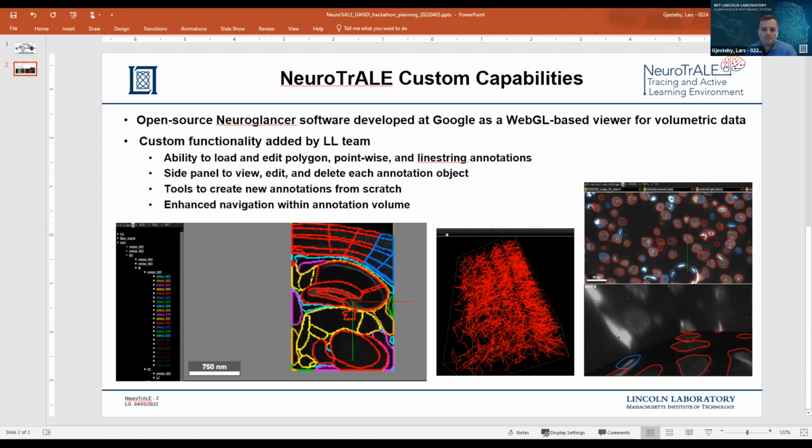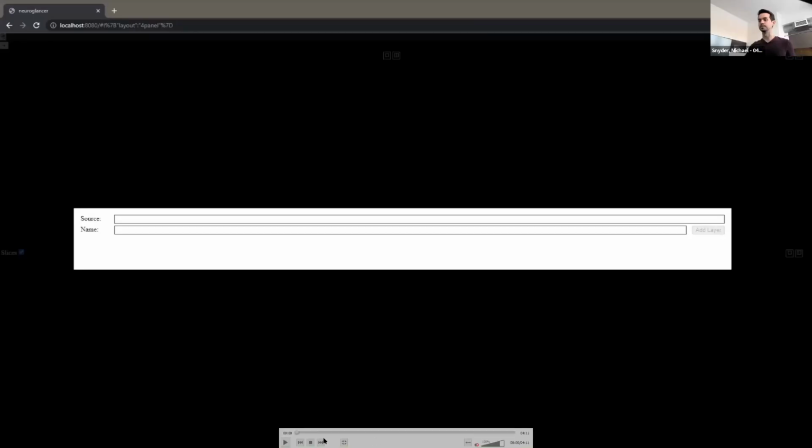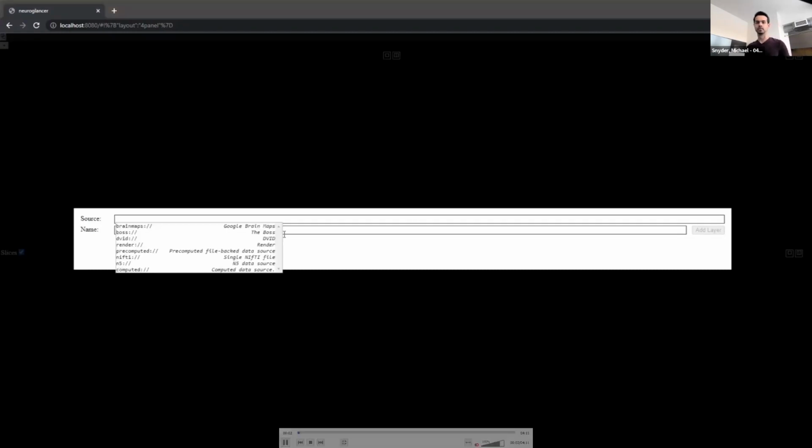Sounds good. Good morning, folks. I'll steal the screen share here. And we have a short video queued up that'll narrate over, showing off the things that Lars was talking about there.